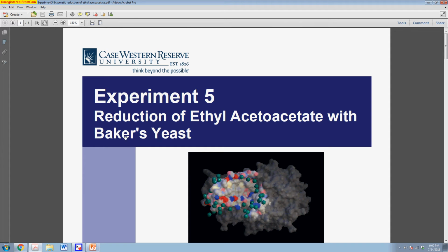So if you read and begin the pre-lab, you might be somewhat confused that it says that you were setting this experiment up in the previous week. We have set up all of these experiments for you such that they will incubate for approximately a week. So in your pre-lab write-up, you can make note that these were set up by the laboratory staff.